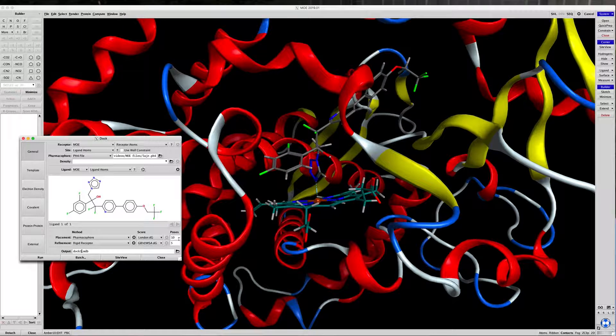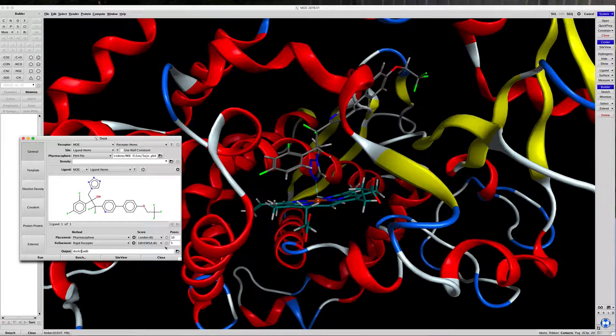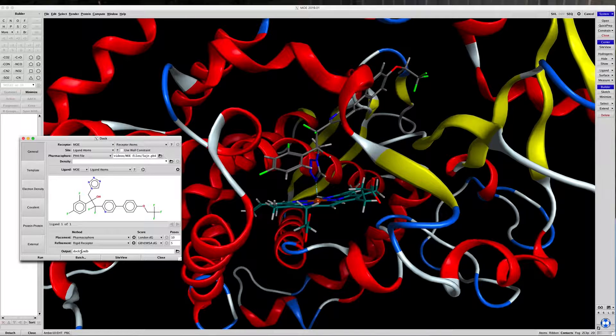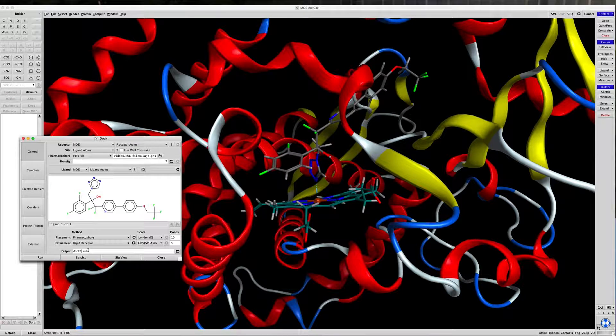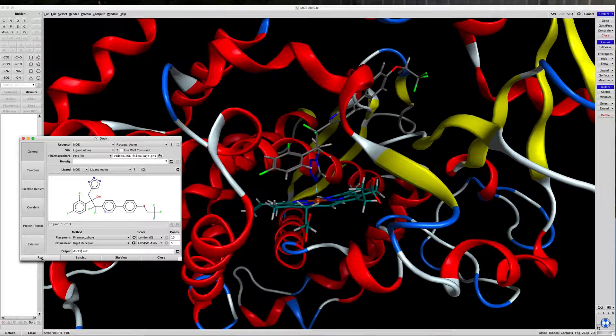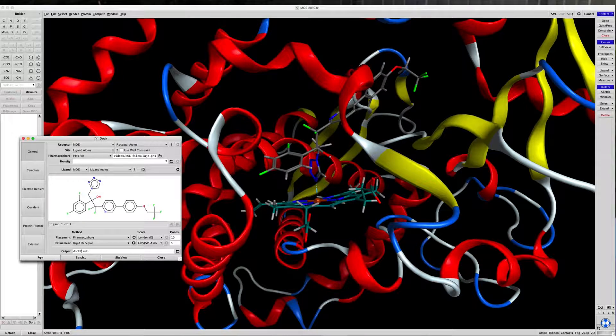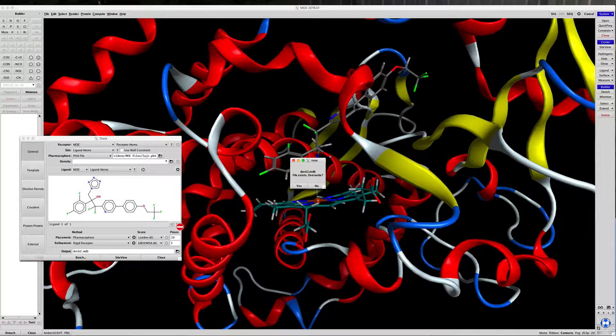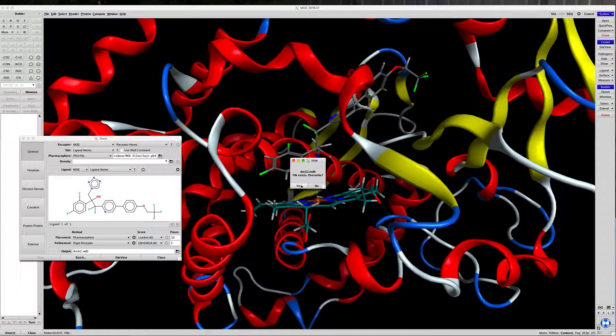We're going to use the same 10 poses. We're going to give this a different name. So let's run docking to exist. We're going to overwrite that.